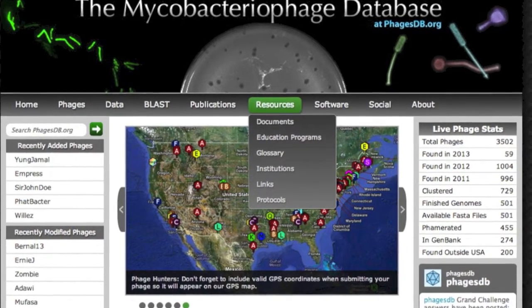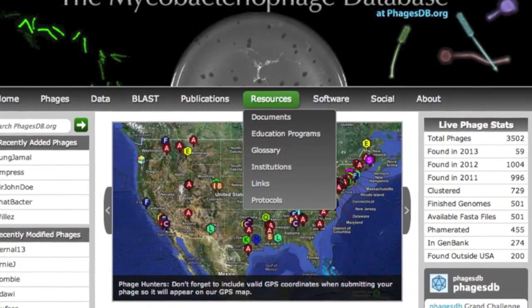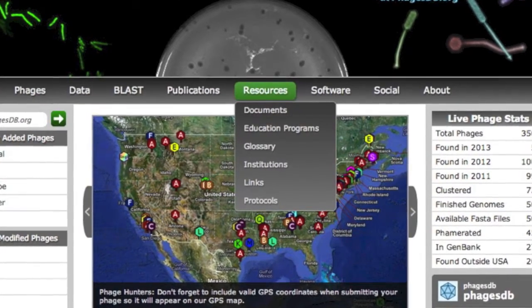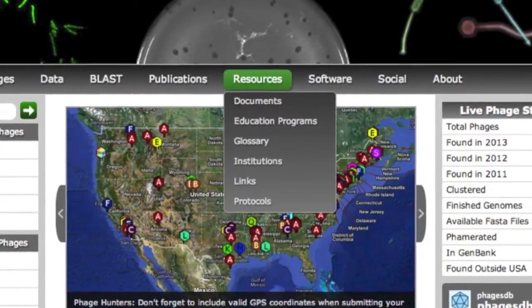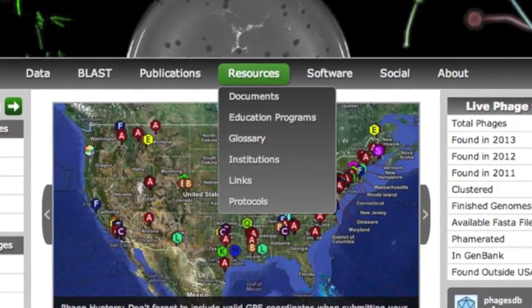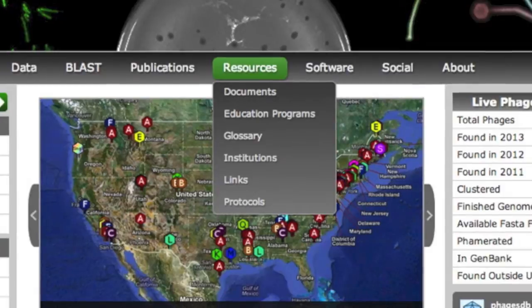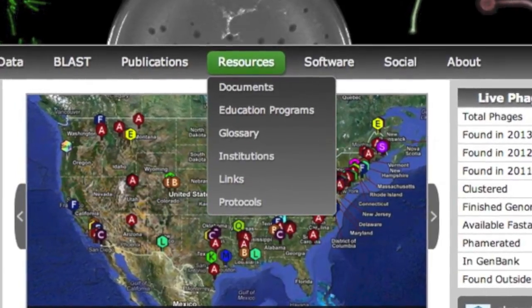This video is an overview of a protocol found on phagesdb.org under the protocols tab. There are three sections to this video and protocol: the first covering documentation, the second sample preparation, and the third, shipping instructions.